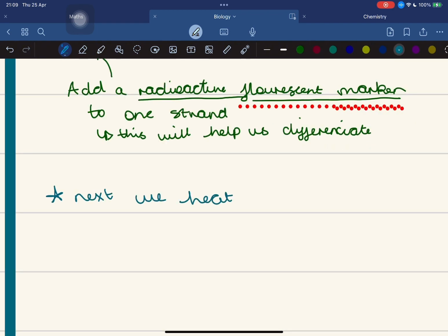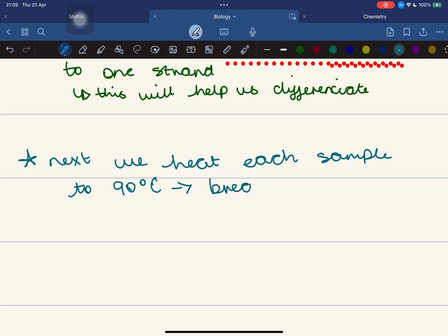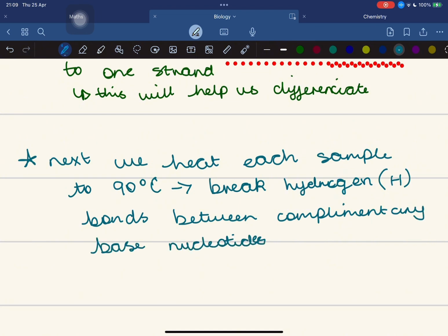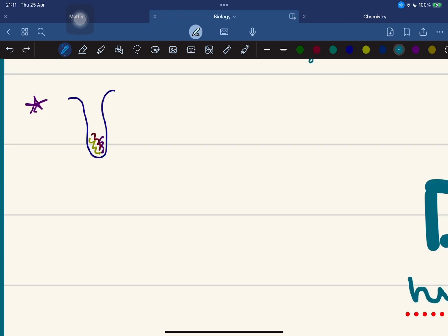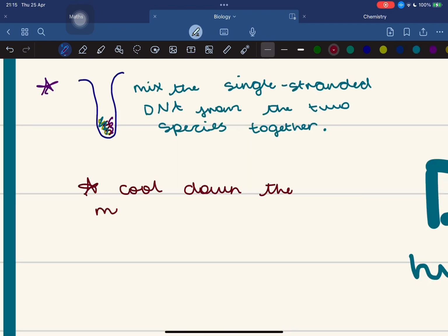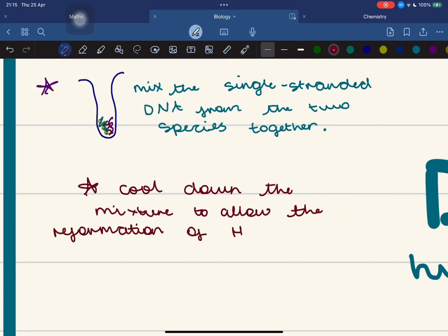Then we're going to heat our samples. You can either mix them before or you can leave them in their separate test tubes and heat. It doesn't really affect the process. But we're going to heat it up to about 90 degrees so we can break the hydrogen bonds between the complementary base pairs. Now we're going to mix all of our DNA together in our test tube, and we want our hydrogen bonds to reform, so we're going to cool it back down to around room temperature so our bonds can reform between any complementary base pairs.